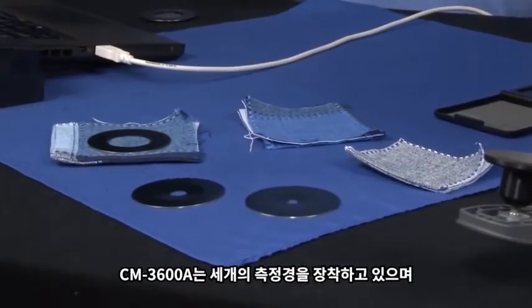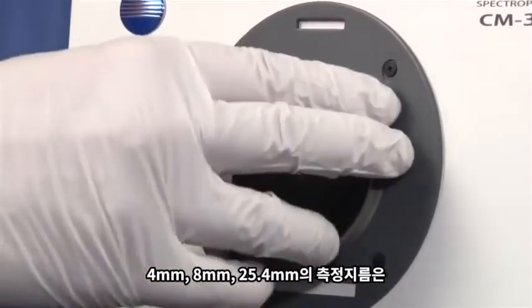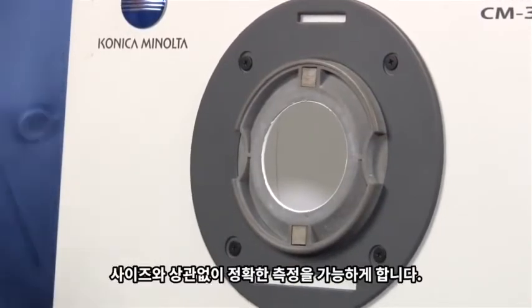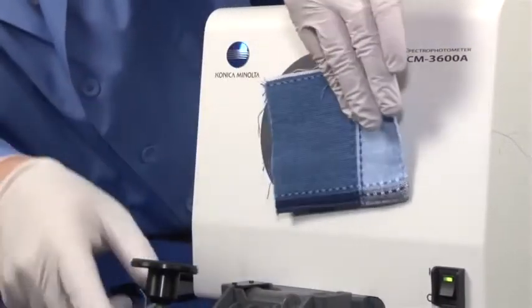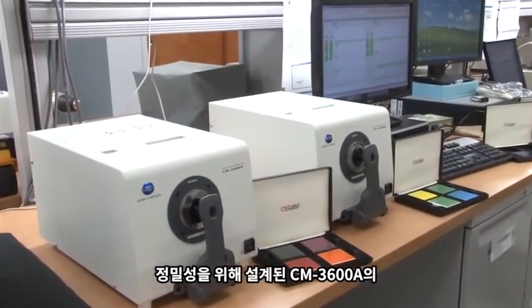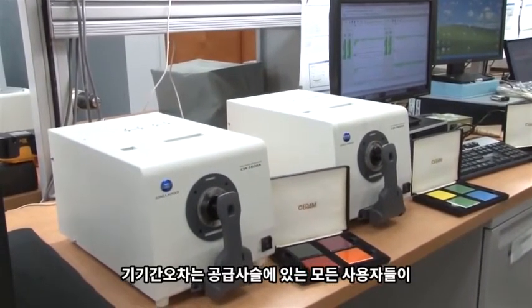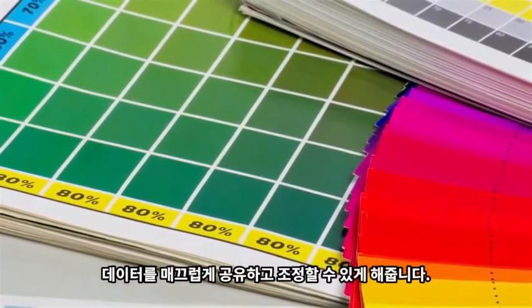The CM3600A is equipped with three different apertures, with a measurement area of four millimeters, eight millimeters, and 25.4 millimeters, to perfectly match any sample size. Built for precision, the CM3600A's tight inter-instrument agreement allows users to communicate, share, and coordinate color seamlessly throughout the supply chain.